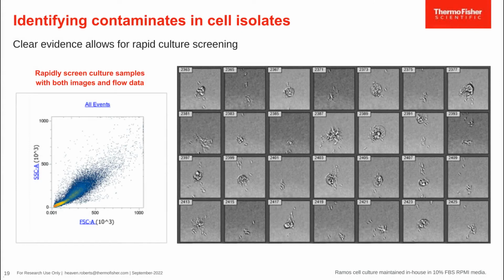And this is just another image. These were those Ramos cells a few days later. You can see these are very unhealthy, unhappy cells. But because the CytPix was able to pick up on these pathogens, now that we know what we're looking for, several days before something like trypan blue or just not seeing confluence, we're now able to put our cell cultures, we can run them off of plates using the CytKick, or we can even just quickly run them out of tubes. And we can screen when we have new lines coming on or lines that we haven't worked with before, to make sure that we're keeping our cell culture incubators nice and clean.